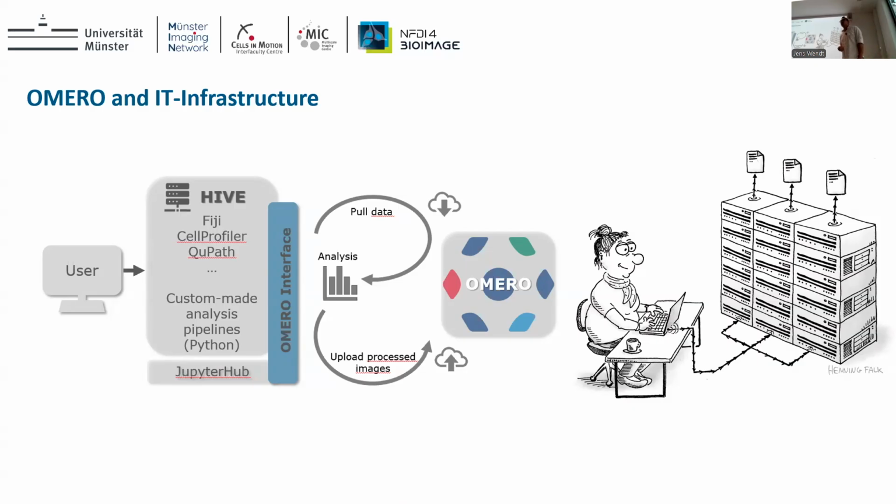So Sarah wrote, I guess together with Jens' help, a CellProfiler Jupyter notebook, where you're just creating your pipeline in CellProfiler in the GUI basically. You're loading this pipeline, saying which data from Omero you want, and then you're doing batch analysis directly on the data of Omero. If you enter then the data in Omero, you have the link back to your results, to your ROIs, and to result images. For example, with Cellpose, whatever you're using in your CellProfiler analysis.